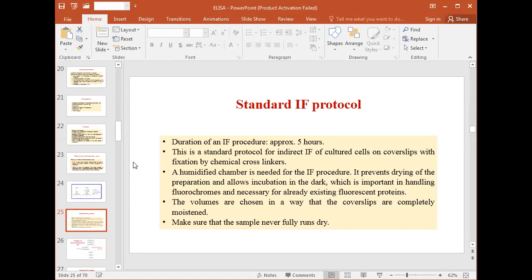All processes should be performed in the dark. The primary antibody is better incubated at four degrees centigrade so the fluorochrome retains its properties and is not excited during the process. The volume applied to the cover slip should completely cover and moisten its surface, and the sample should remain moist throughout preparation.